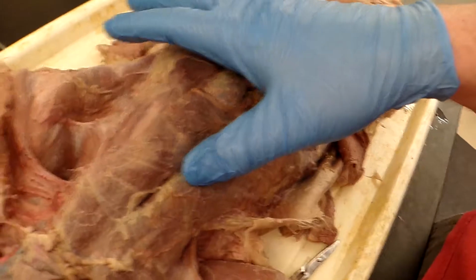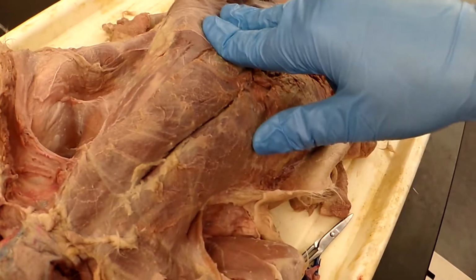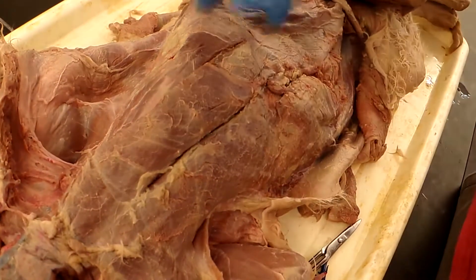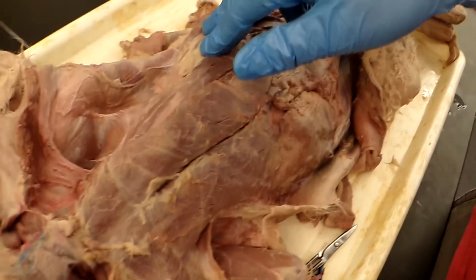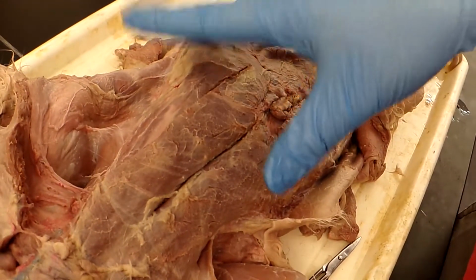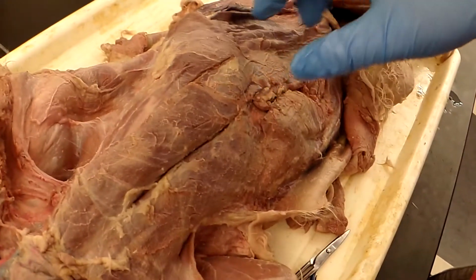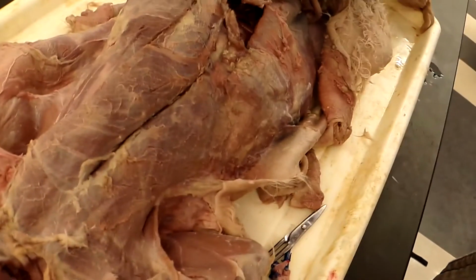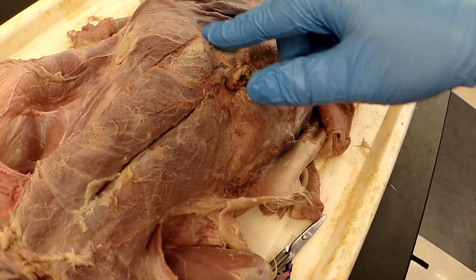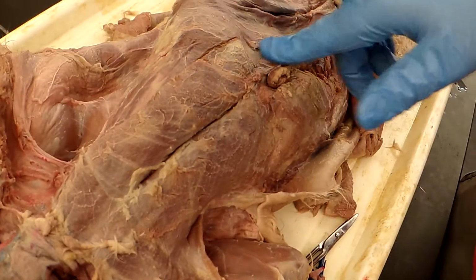Yeah, it's also below there, and it also connects to the rib. It originates at the rib, and the function is also to draw the rib cranial. And then next is the rectus abdominis. That is right down the middle here. The origin is the pubis, the insertion is the sternum, and the function is that it compresses the abdomen.